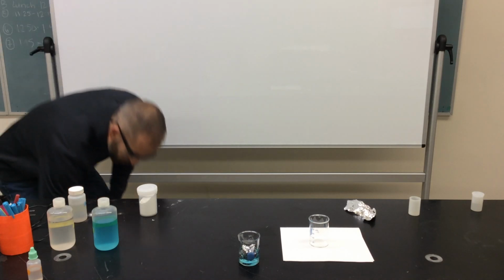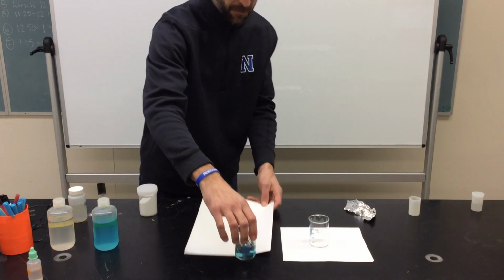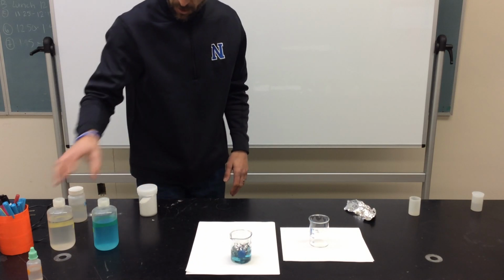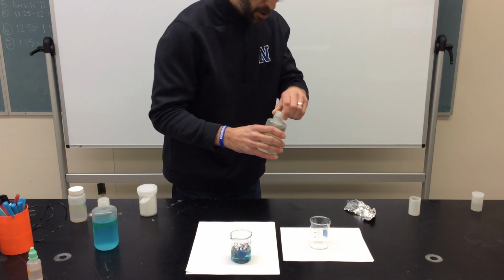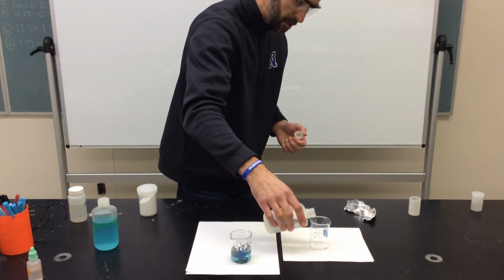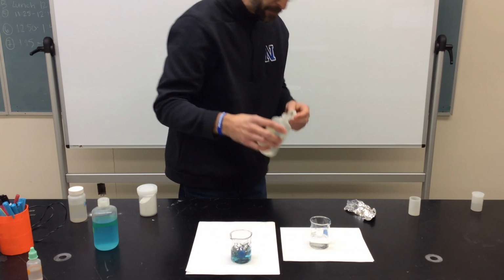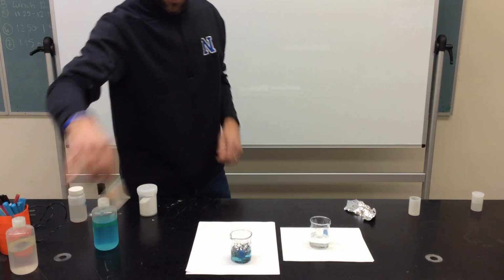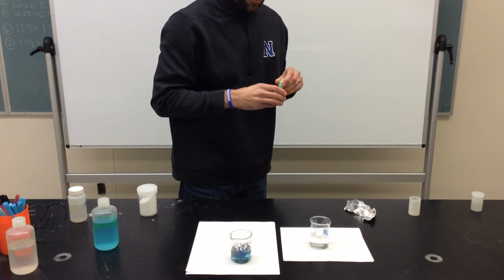So in our next experiment, we're going to add some hydrochloric acid to a beaker. So we can make a couple of observations about our hydrochloric acid. Hey, it's a clear, colorless liquid. So we're looking at physical properties there. And this is sodium carbonate, also a clear, colorless liquid.